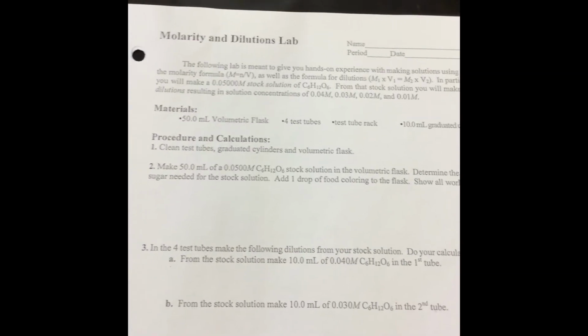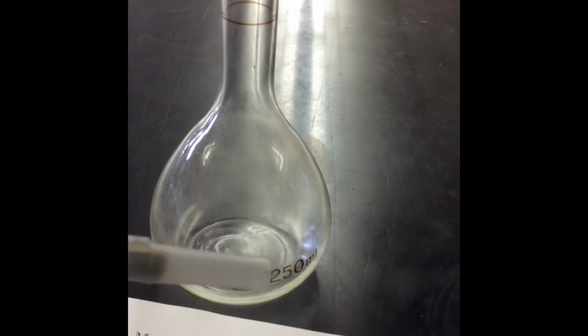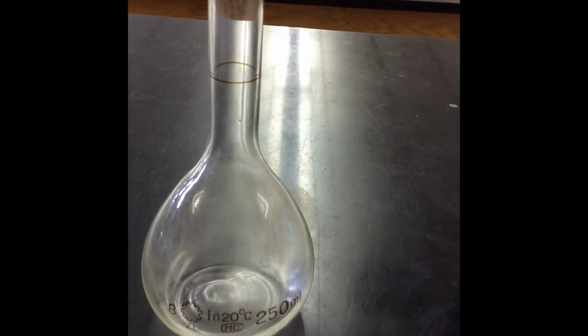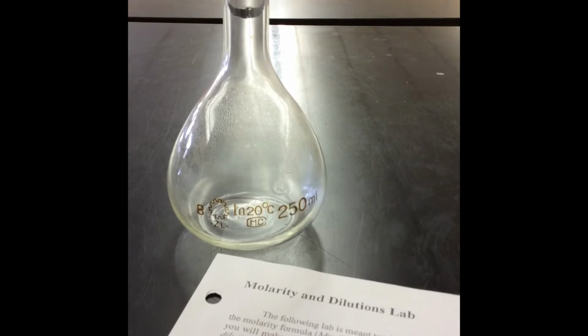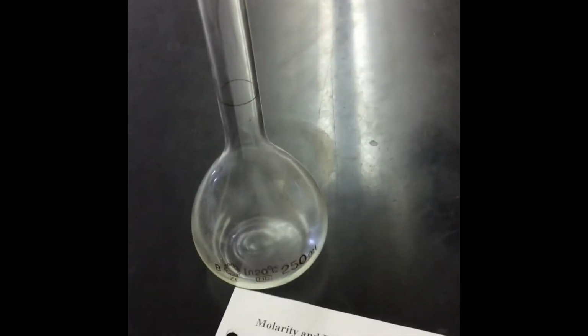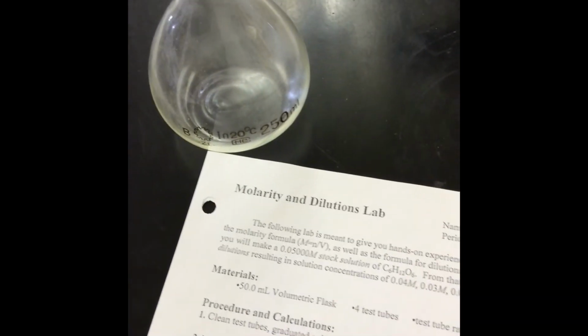When you are making a stock solution, you use a volumetric flask. Now in this case, the volumetric flask is 250 milliliters, and on any volumetric flask there is a line on the neck somewhere. So that dark line that is right there, when you have the liquid filled up and the meniscus reaching that line, that is telling you that you have exactly 250 milliliters. So when you are using a volumetric flask, what you have to do in this case is figure out how much sugar you have to add to the volumetric flask.